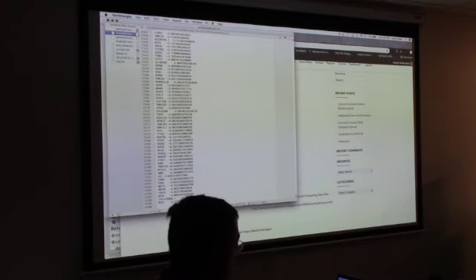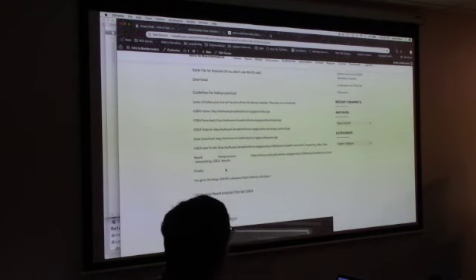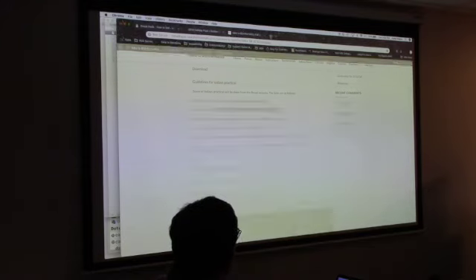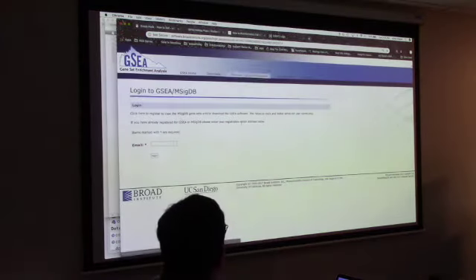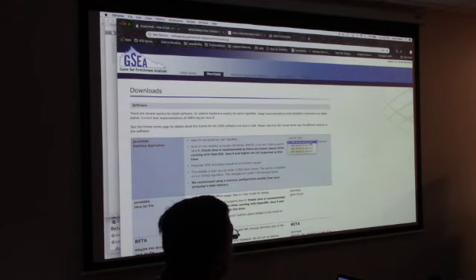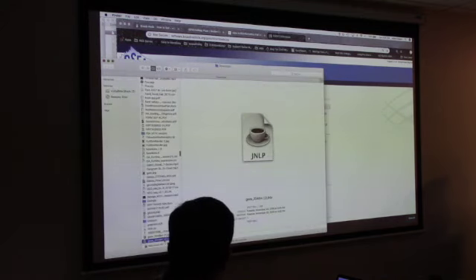Okay. All right. So once we have this, here are your guidelines for today's practical. We go to the GSEA home, which is here, and we go here to the download, and we go ahead and download our software. Okay. So you usually enter your email, log in, and then you select your memory requirements. I just say 2 GB, more than enough. Launch. It says this here, discard or keep, so you keep this, and then you look at that in Finder, wherever it is, and you could double click it.